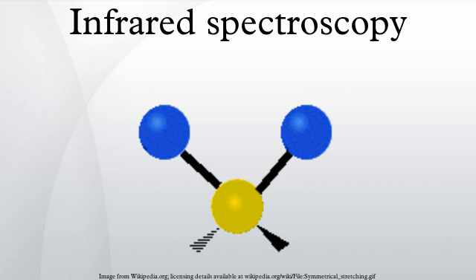Number of vibrational modes. In order for a vibrational mode in a molecule to be IR active, it must be associated with changes in the dipole. A permanent dipole is not necessary, as the rule requires only a change in dipole moment. A molecule can vibrate in many ways, and each way is called a vibrational mode. For molecules with N number of atoms in them, linear molecules have 3N-5 degrees of vibrational modes, whereas nonlinear molecules have 3N-6 degrees of vibrational modes. As an example, H2O, a nonlinear molecule, will have 3×3-6 = 3 degrees of vibrational freedom, or modes.